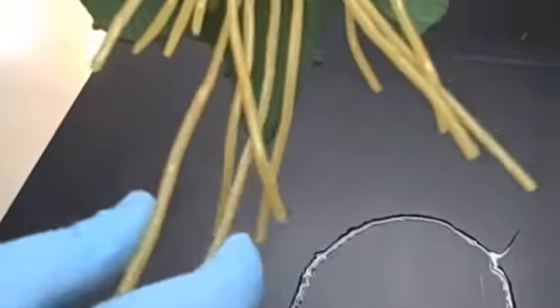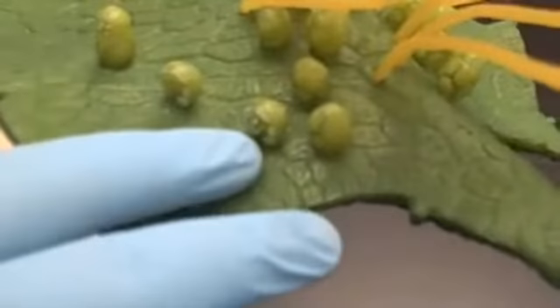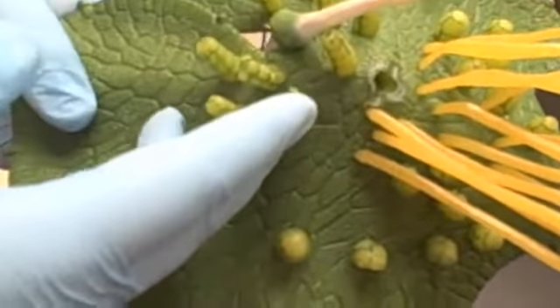If we look on the underside of the gametophyte, we see several structures. These long yellow structures are called rhizoids, and they anchor the gametophyte to the soil. Here we see antheridia, which form sperm, and archegonia, in which the egg resides. During a rainstorm or a period of high water, sperm will be released from the antheridia and will swim through the water present on the gametophyte and swim down these tubes to find the egg and fertilize it.